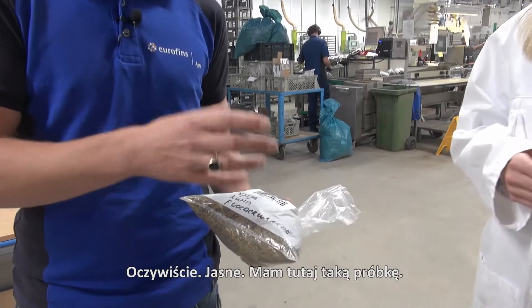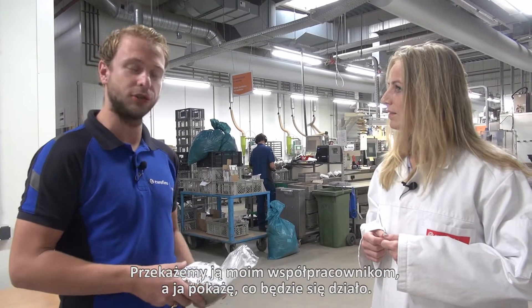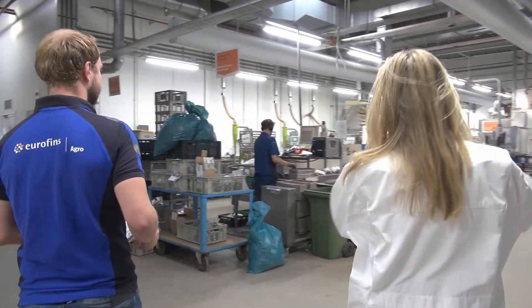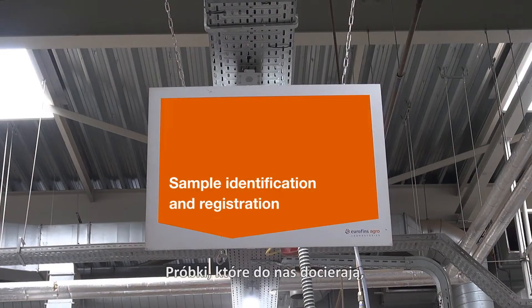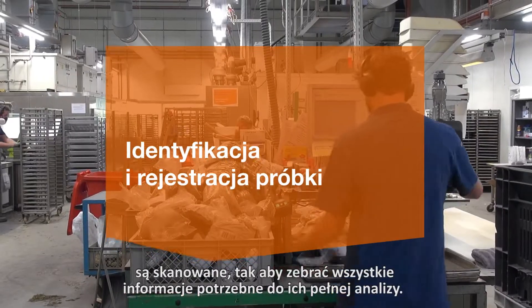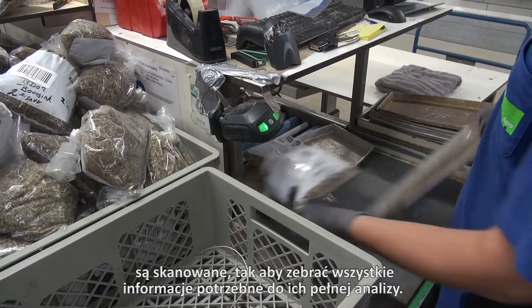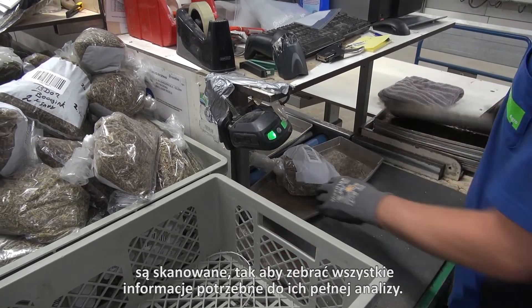I've cut the sample here and I'm going to give it to my colleagues. The samples are coming in. They are scanned by the handheld of our sample taker, which contains all the information we need to fully analyze the sample.